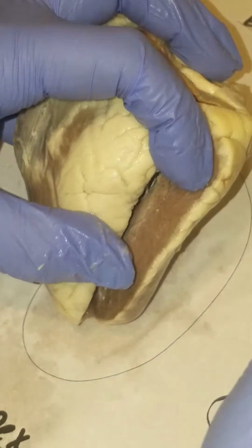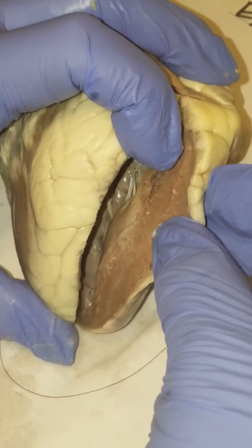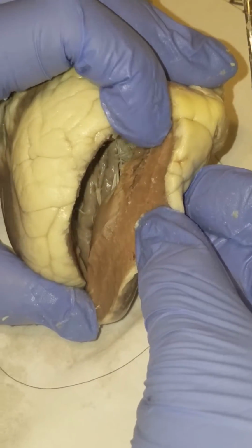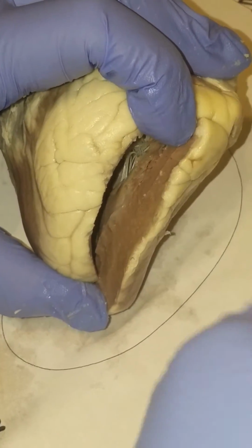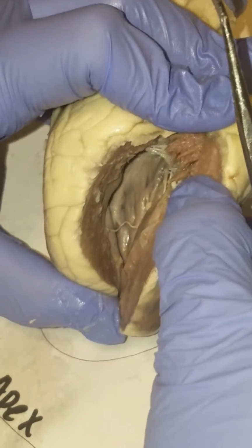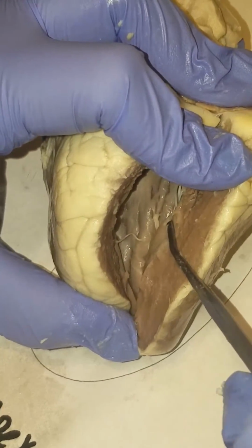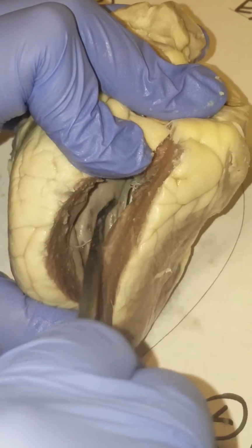The myocardium of the left ventricle is thicker because it needs to pump blood to the rest of the body, whereas the right ventricle only needs to pump blood to the lungs. So you can see it's about 3 times thicker than the other. The trabeculae carneae is the inner surface of the ventricle, so it's way inside here. The interventricular septum is in here.